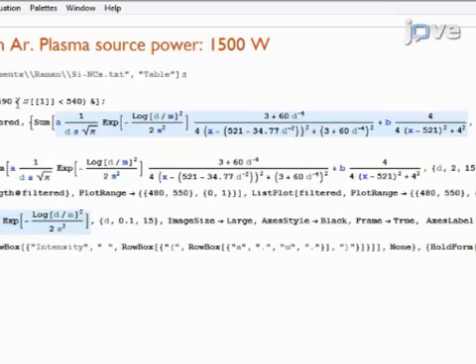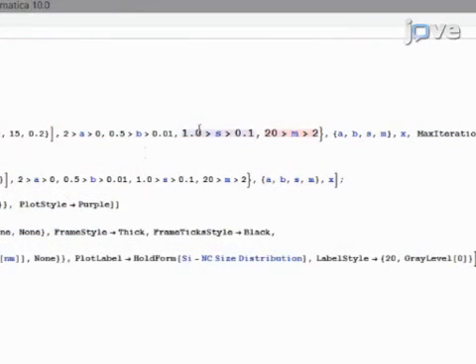For the fitting procedure, type the fitting function shown here into an analysis program such as Mathematica. Ensure that the interval for skewness is between 0.1 and 1.0, and the mean size interval is between 2 nanometers and 20 nanometers.